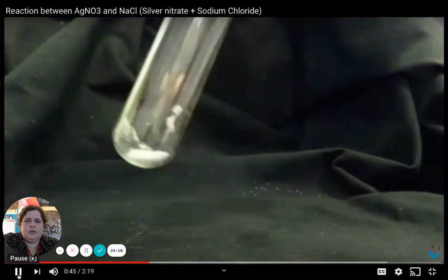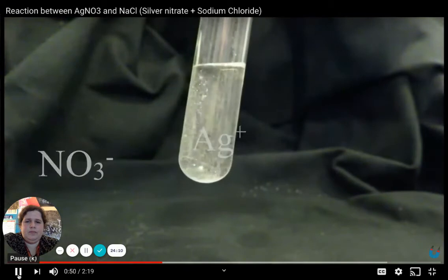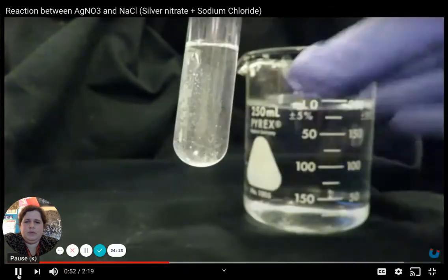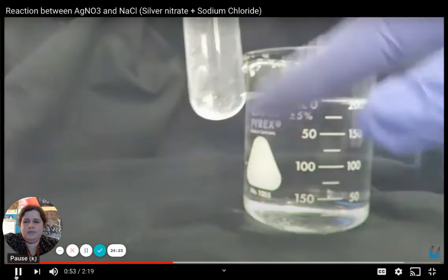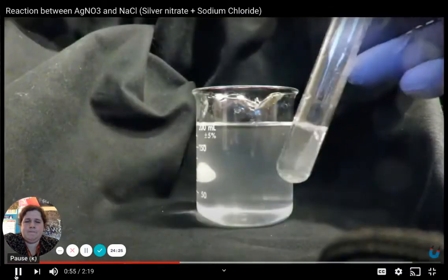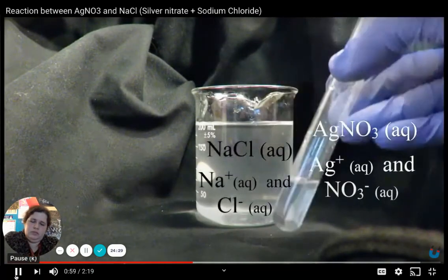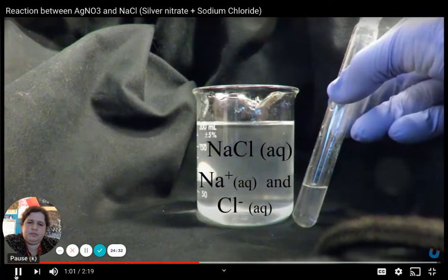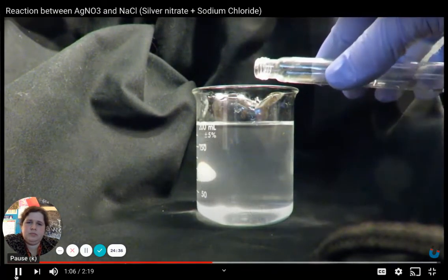We also have AgNO3. We put water in there, we get Ag+ and NO3-. It dissociates or dissolves. So he just made a solution of silver nitrate. And the reason why we want two solutions is to show that it's two liquids becoming a solid. So now that we have these two aqueous solutions, the AgNO3 and then the NaCl, we'll mix them together. Remember, they're both aqueous, so they're split apart into their ions. When we do that, this is what happens.